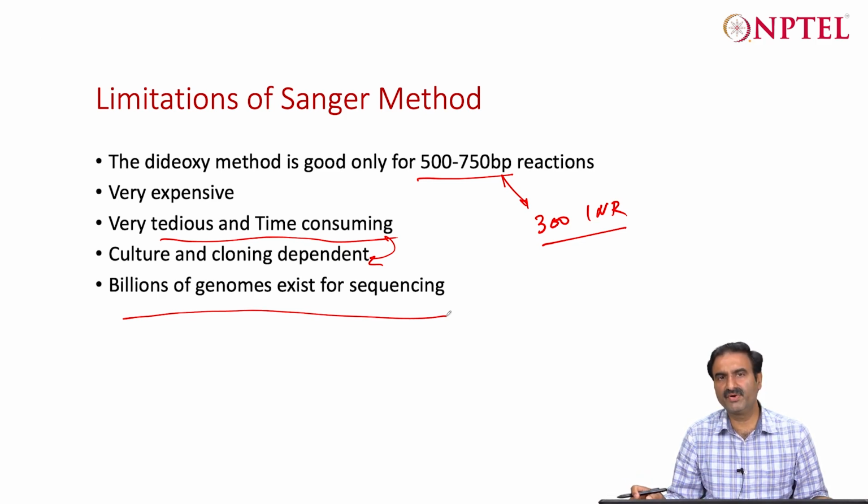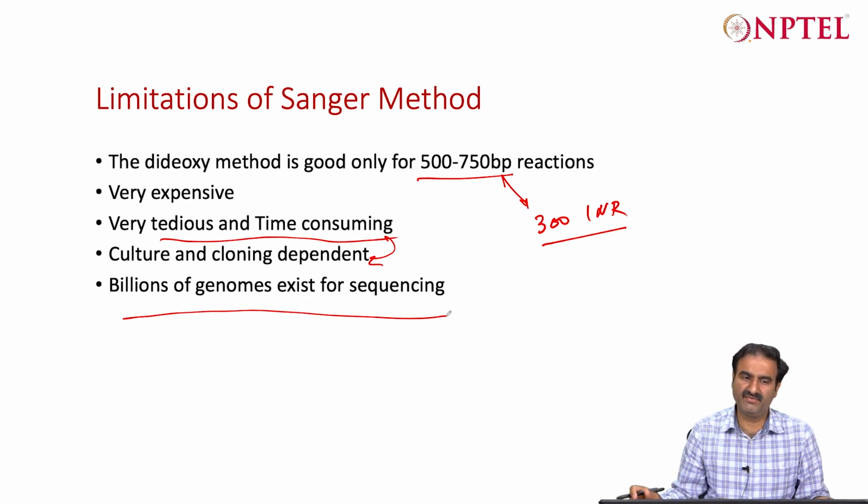So that is not possible by this, but it will always have a role and importance, because at least for the identification of those, when you are using a molecular marker, you cannot use a next generation sequencing technology, but you will be using a Sanger sequencer.